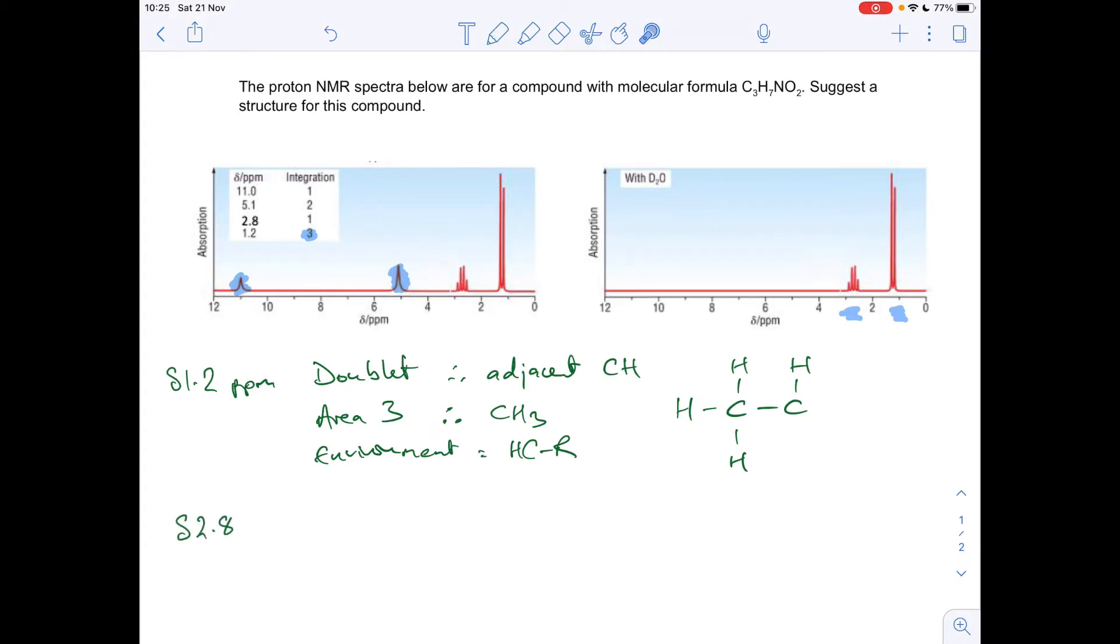So moving on to delta 2.8 now. So this one here. We're going to do exactly the same. So this is always the format that I say to my students to put your answers in. So what have we got? We've got a quartet. Therefore, there must be an adjacent CH3. It's got an area of 1. So there's 1 proton in the environment. So it must be a CH.